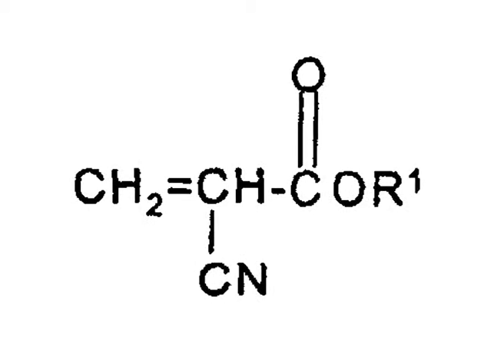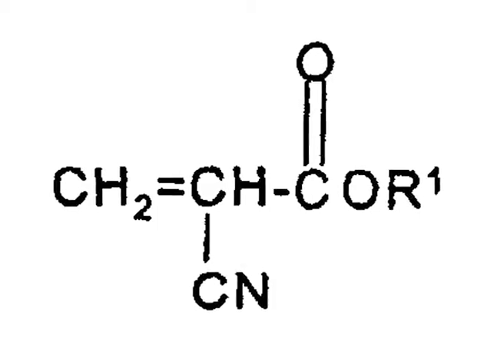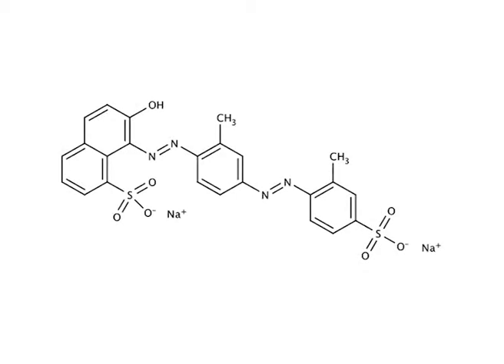The surface impinged with blood prints is first baked in an oven for 5 minutes. It is then suspended from the roof of a cabinet containing a china dish comprising cyanoacrylate ester. The item is exposed to the vapors for about 2 hours until a whitish colored fingerprint pattern develops. Thereafter, it is successively treated with the Coomassie Brilliant Blue R staining and de-staining solutions. On drying, fingerprints appear. Next reagent is the Crowle's reagent.